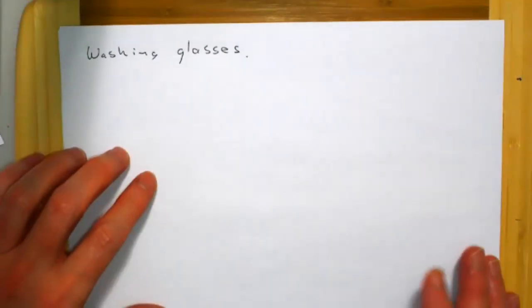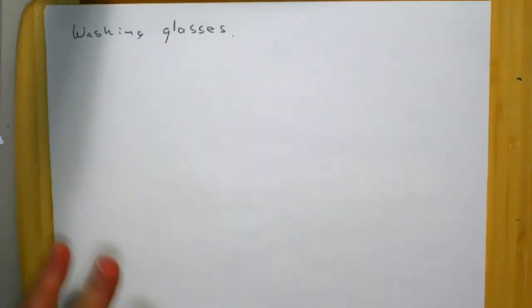Now, in our first lab, soap's not a bad contaminant because the soaps we use are usually pH neutral. So soap's not so bad. But once we start doing nickel and calcium, then we're going to have metals, and soaps are designed to react with metals. Soaps are called anionic surfactants. So don't get crazy with the soap, and make sure you use the right kind of soap.